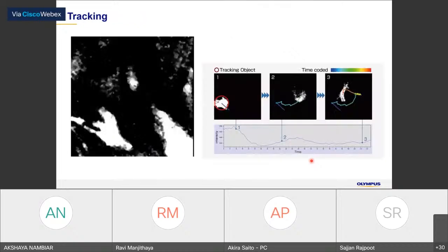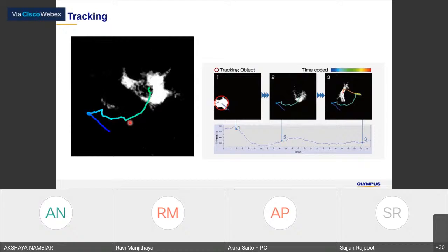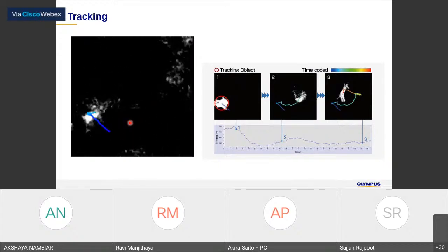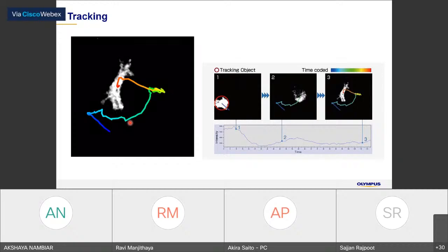And also, if you have any time-lapse imaging, after the detection of the objects you can link the objects through the time points and do this kind of tracking, and analyze the intensity changes, and also how fast it moves or which direction it moves.